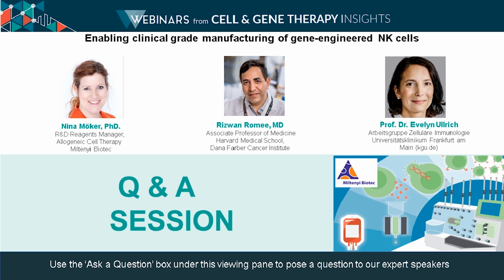Brilliant. Okay, we're coming up towards the end of the webinar, but we'll try to squeeze in one or two more very quick questions. So for Nina, why do you transduce the NK cells prior to expansion? All right, thanks a lot. The reason is that, to save money by using as little lentiviral vector as possible, we try to transduce as early in the culture as possible.